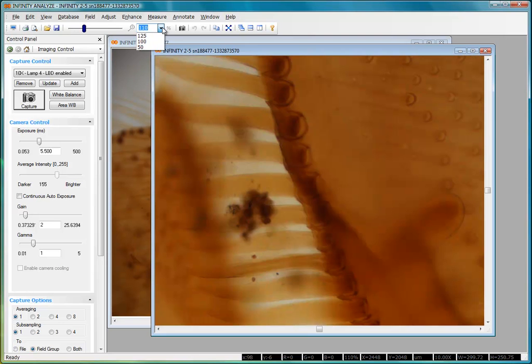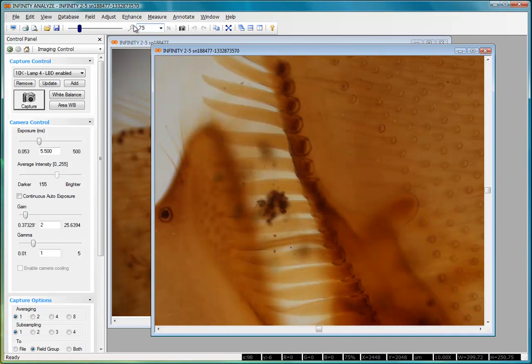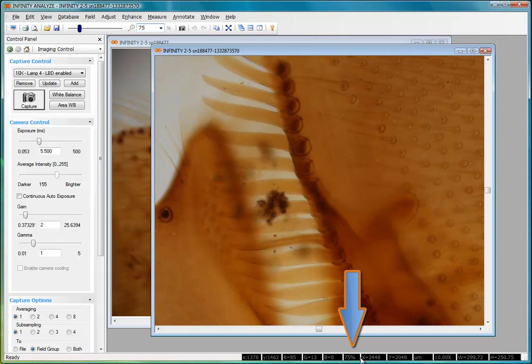If there's a particular zoom level that you want to go to, simply type the numerical value in and hit the Enter key, and the image zooms to that percentage. You can see down in the status bar here, it indicates we're at a 75% zoom level.